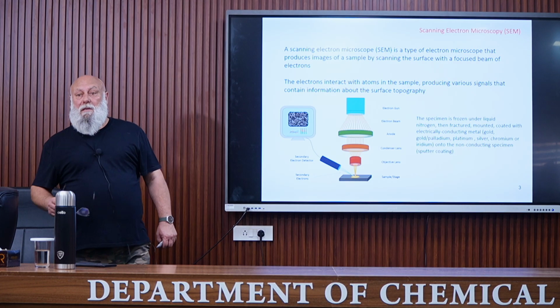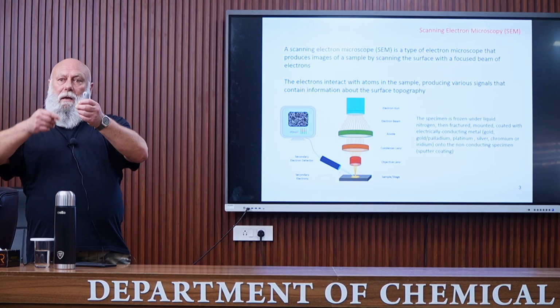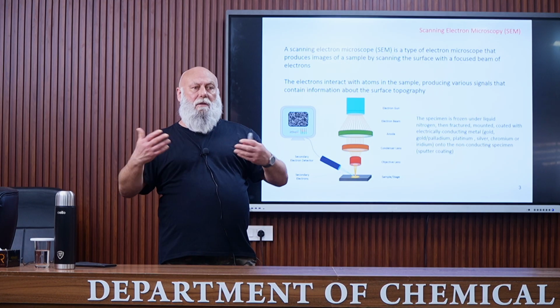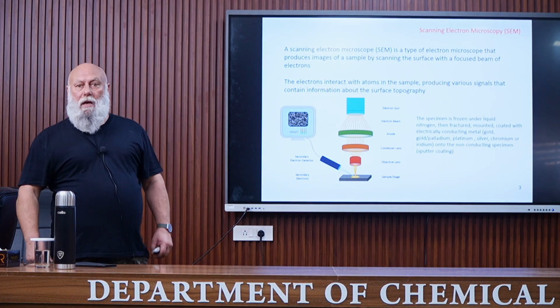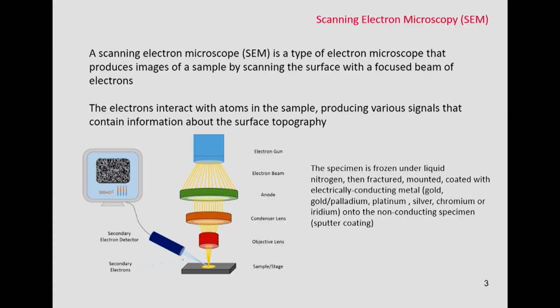And also, it's important to have a brittle surface because usually the thickness of the sample is observed, so the facies of rupture is observed, and it's necessary to have a brittle fracture to avoid any plastic deformation that can induce some wrong information. For this, it's necessary to dip the material in liquid nitrogen, so at very low temperature, and to break the sample at this temperature to be sure to have a brittle fracture.